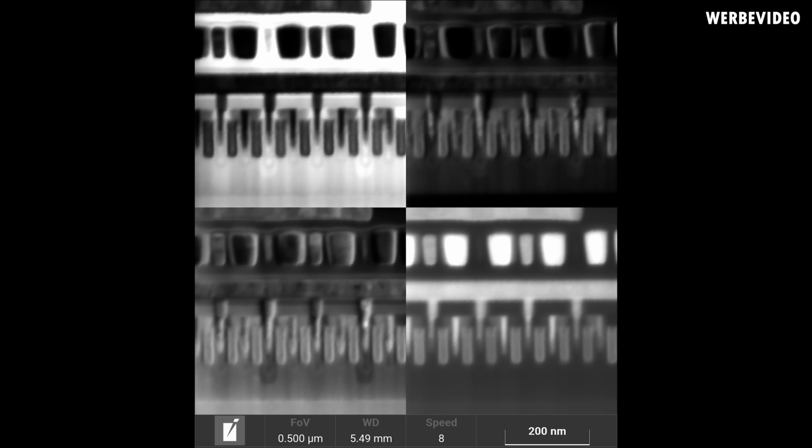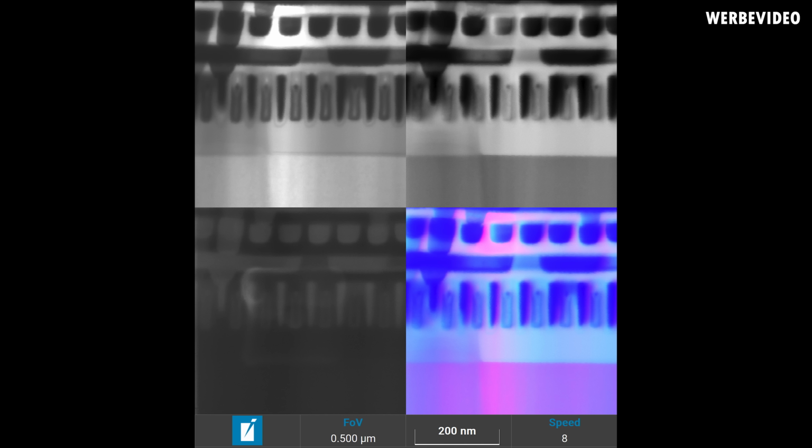Now going back to the previous image, we see all those transistors sitting next to each other. On the bottom right, you see a scale with 200nm. Just keep your eye on the scale, because we're switching to a different view now, but the scale will be exactly the same, 200nm. And you can see not much changed if you kept your eye on the top left corner. The dark areas again are all the gates where we cut through.